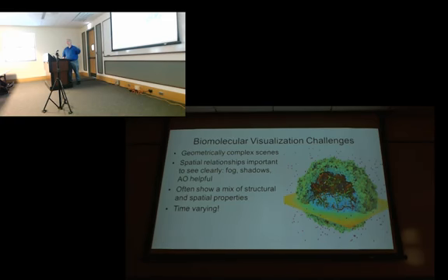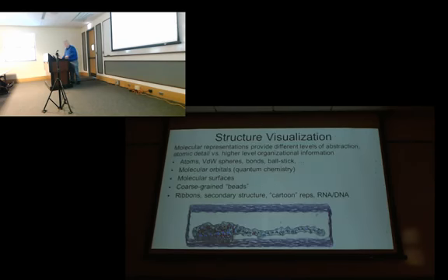And the point of this is, you don't need to become a computer graphics expert. The point of this is for you to exploit your natural visual intuition to just look at an image like this and see the pockets, cavities, and crevices without having to do a bunch of work to create an image that is informative. So we want to make scenes that have a bunch of spatial and structural properties, and in many cases, time-varying data. So we have a lot of different problems to solve.